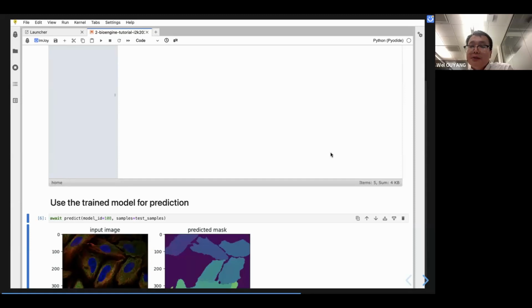Is there another question? There's another one. When you talk about on-premise deployment, what are the prerequisites? Full installation of BioEngine, how to install all the dependencies?